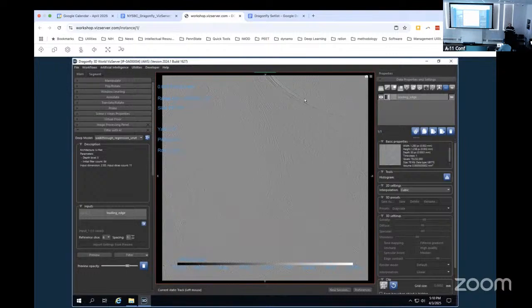So leading edge, normally you can just scroll up and down with your wheel or your scroll bar to move through the tomogram. But for some reason on this remote server, it's not letting that work. And so one of the other tools is that all of this text on the window right here are actually tools that you can click on and drag. So if you go over the slice number and you click on it and drag, you'll see that you can actually move through the tomogram. Now, we're going to have to use that a lot today because the scroll wheel's not working.